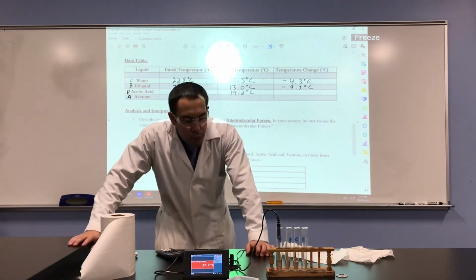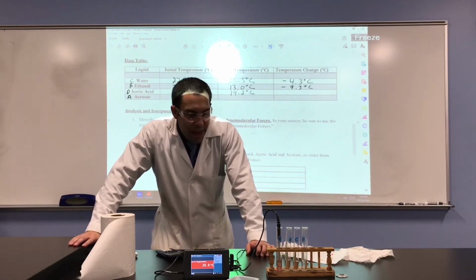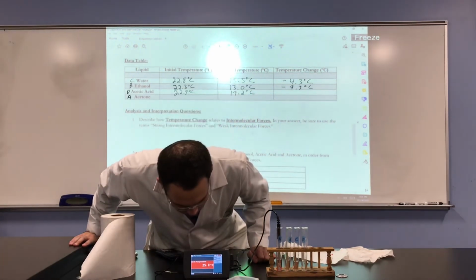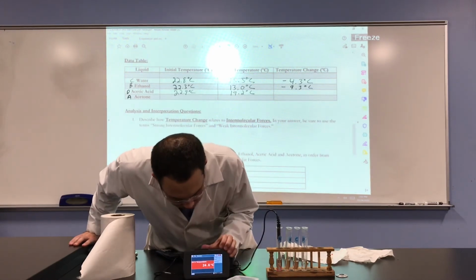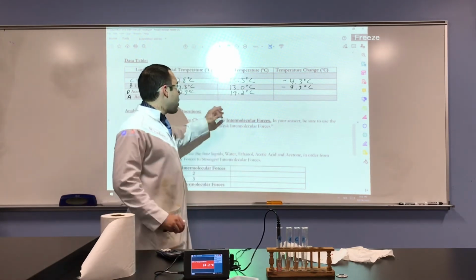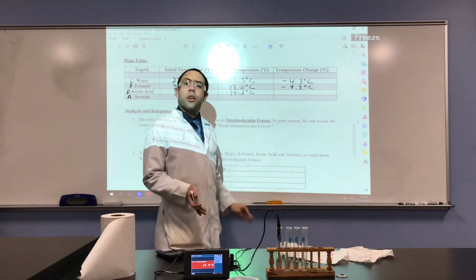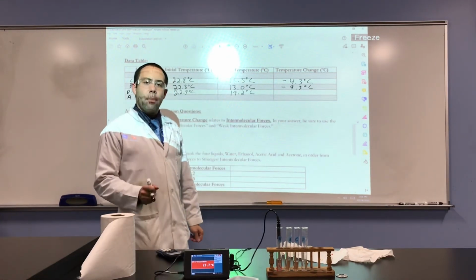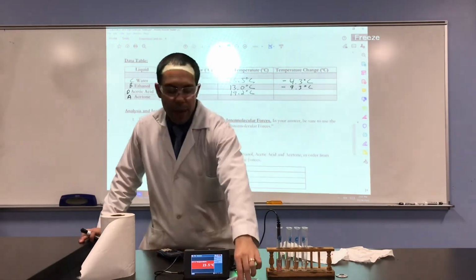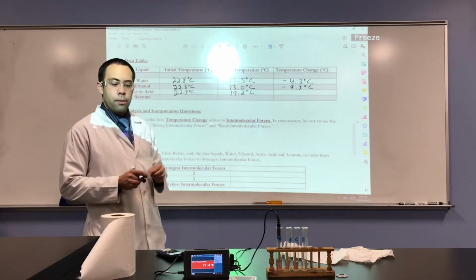I just saw the rubber band break. So we're going to have to be very careful when we're pulling the probe out to not lose the filter paper. And we'll wait for the temperature to normalize. So before we were talking about intermolecular forces, and the greater the temperature change, the weaker the intermolecular forces. Think about what's happening. We're pulling the probe out of the liquid, and the filter paper is saturated with that liquid, either water, ethanol, acetic acid, or acetone.